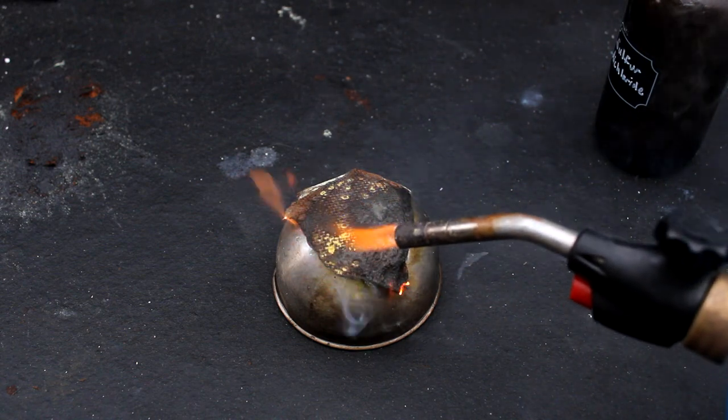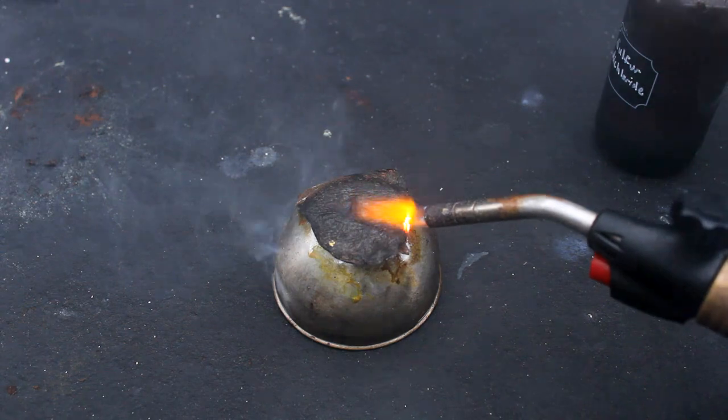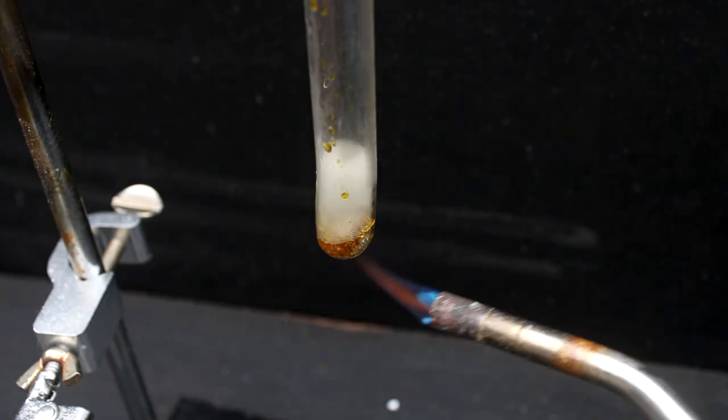The paper towel failed to ignite in the presence of sulfur dichloride. If anything, this compound seems to inhibit combustion. It did let off a lot of toxic smoke, however, which was mostly sulfur dioxide and hydrogen chloride. Anyways, now for our next contestant: sugar. This once again gives a very disappointing result, even when I hit it with my blowtorch.